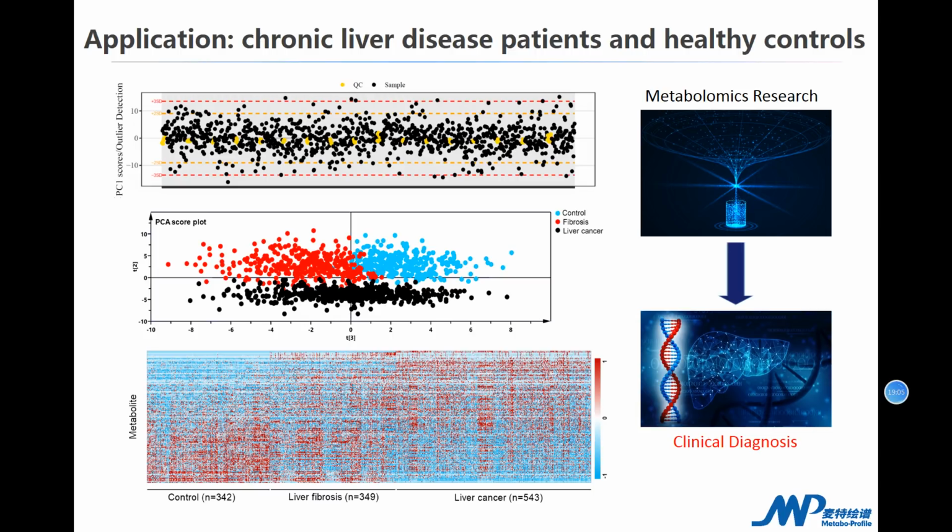17 assay kits were used for the analysis of all the samples. 5 pooled QC samples were analyzed within each kit. A multivariate control chart was established using the score value of one model dimension of PCA, this figure. MCC displays the data measured on the process over time and monitors variations produced by a series of laboratory procedures.